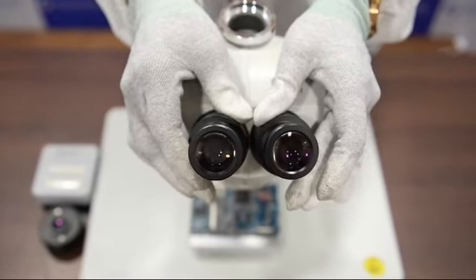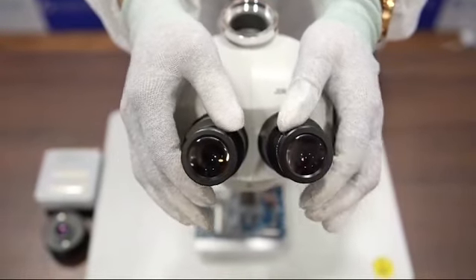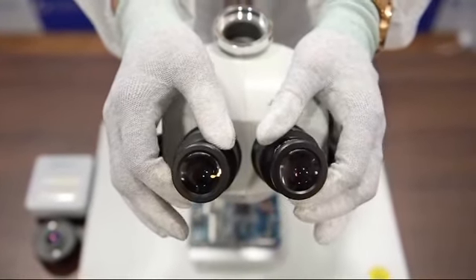These are the cullers which can be adjusted according to eye preference. These are the eyepiece which is 10 by 23 mm.